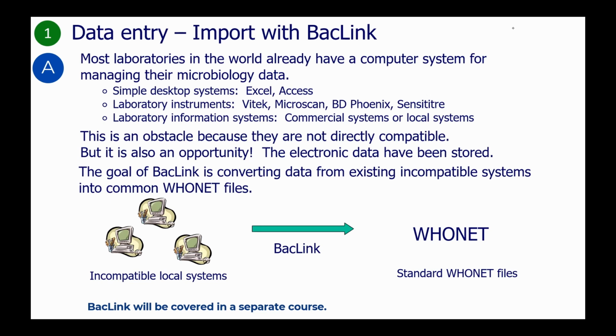The previous slide presented manual data entry into WHONET. However, if you already have a data management system, it is usually possible to import your data into WHONET using the BacLink software, which avoids the need for double data entry. Most laboratories in the world, especially in medium and high-income countries, already have computer systems for managing microbiology data.